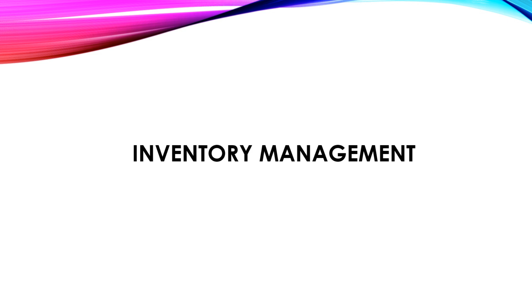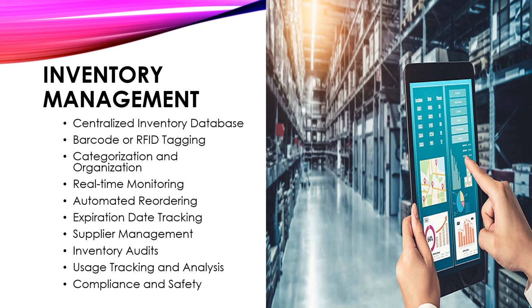Inventory management. Inventory management in laboratory management systems plays a crucial role in ensuring the efficient operation of laboratories. The following are some key aspects and best practices for managing inventory in laboratory settings. The first is the centralized inventory database.